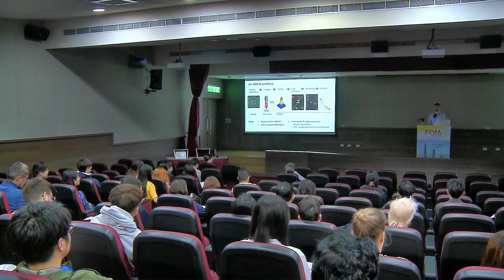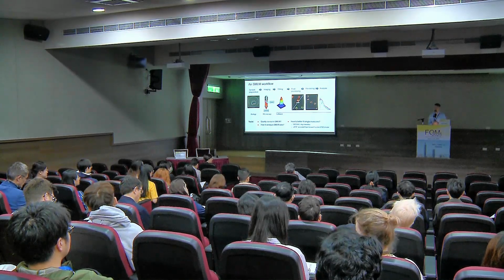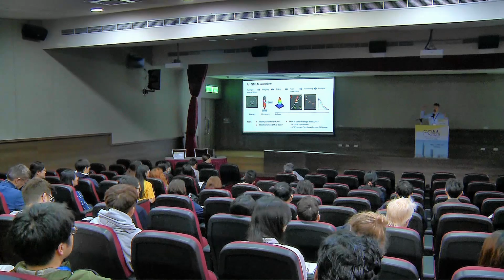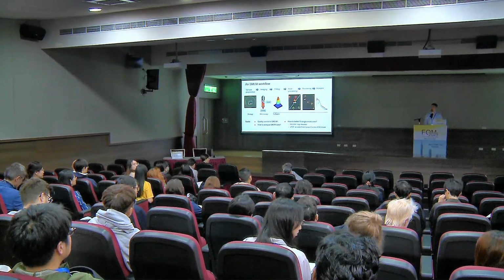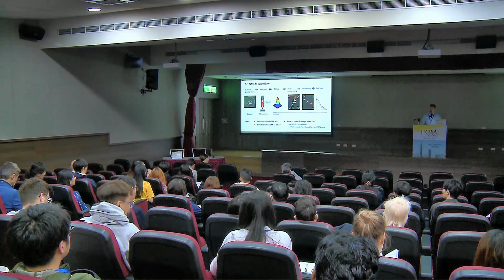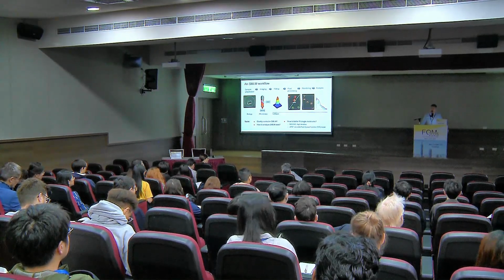And we now implement it in a way that we try to use it even to align the 4-pi microscope, where we have deformable mirrors and then use the output of UIPSF to change the deformable mirrors to correct for these aberrations. So still you need a bit this stack. You can't directly fit it with the single molecule data already? We can. We do this, yes.